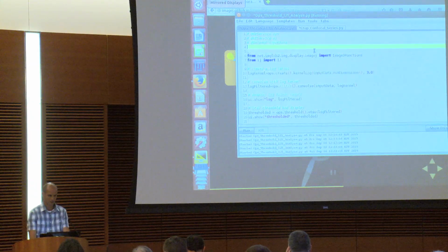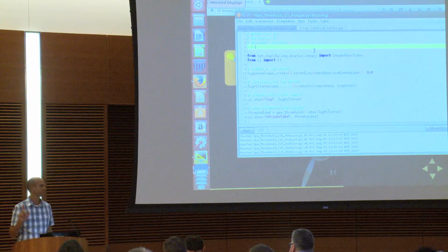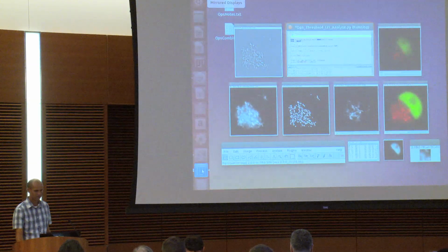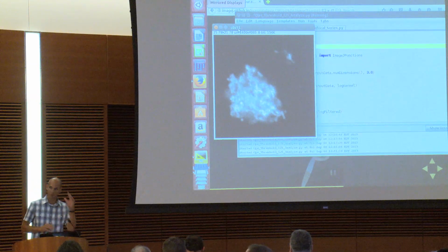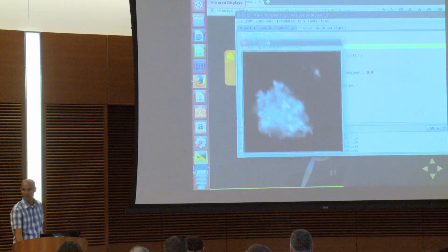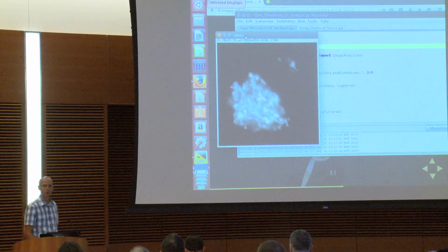What I'm going to do here is use my parameterized scripting style. Which sample image is this again? The image that we've been using was created from the first script. The easiest thing to do, if you don't have it up anymore, is to close every single image, run the first script, and then you should get this image, and maybe save it if you don't want to regenerate it again.